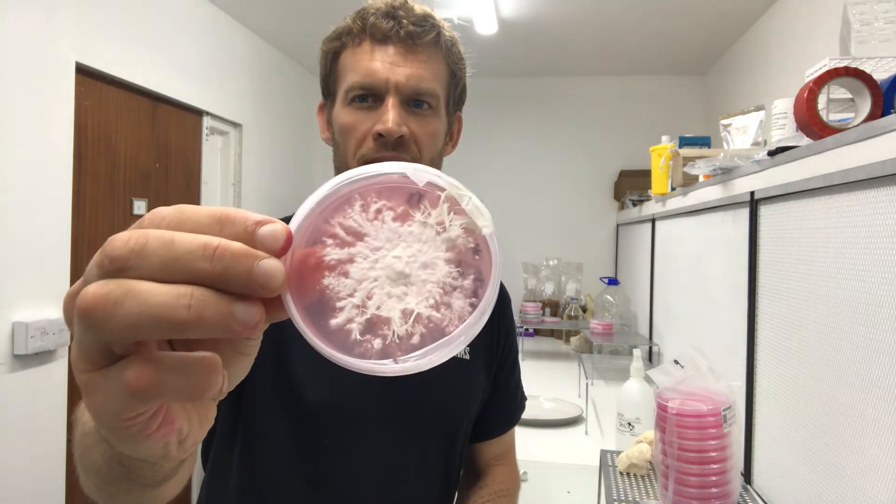I've got a lion's mane plate there which I've taken from another agar plate, and you can keep doing that. As long as the nutrients on the plate keep changing it will be fairly healthy, but it does get tired after a while. You'll find that if you keep expanding it out from the same mycelium, over time the size of your fruit or your harvest will diminish.